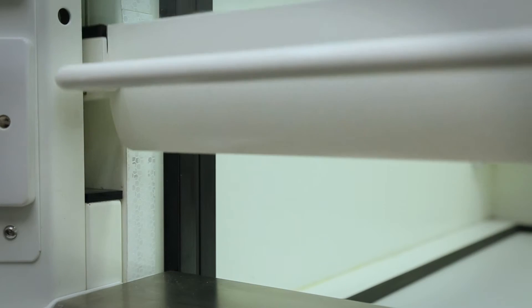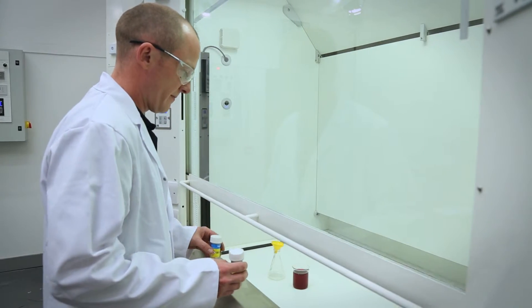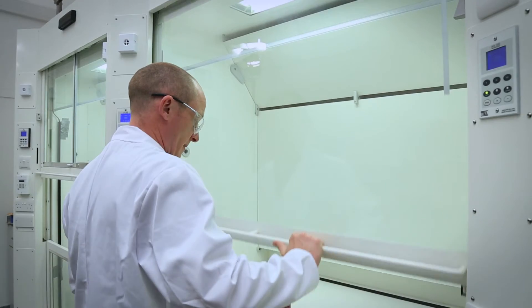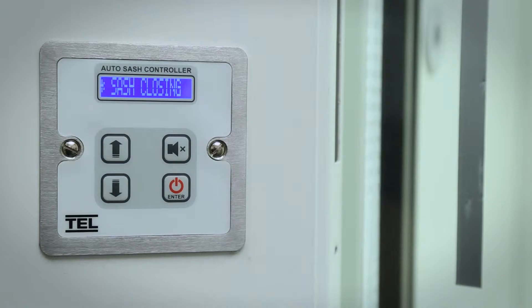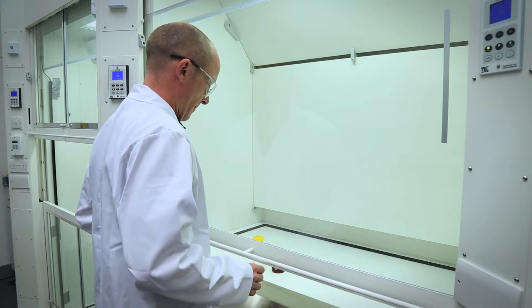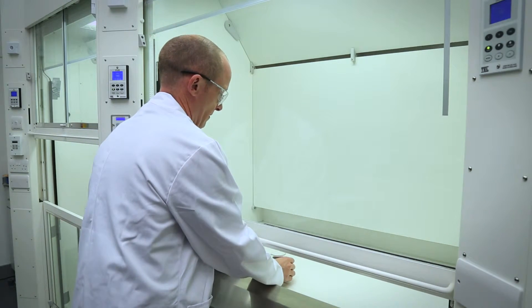The auto open function will automatically open the sash when the user returns to the fume hood. If the user has specifically left the sash at a height for safety reasons, the auto open function will only open to that height when the user returns.